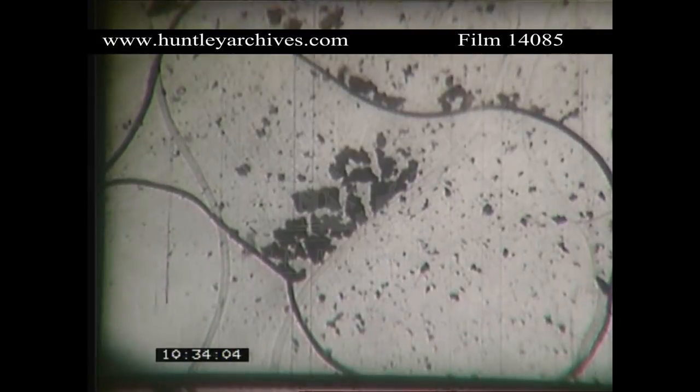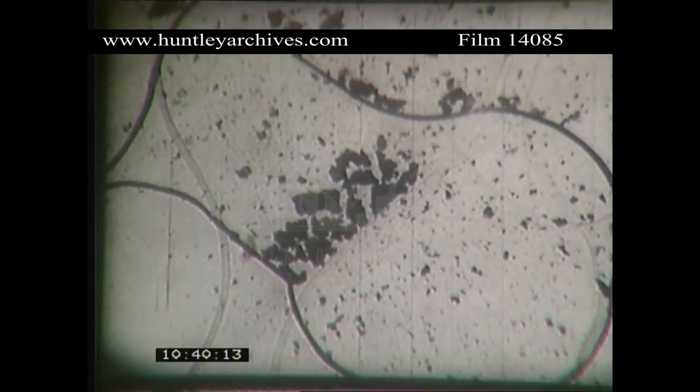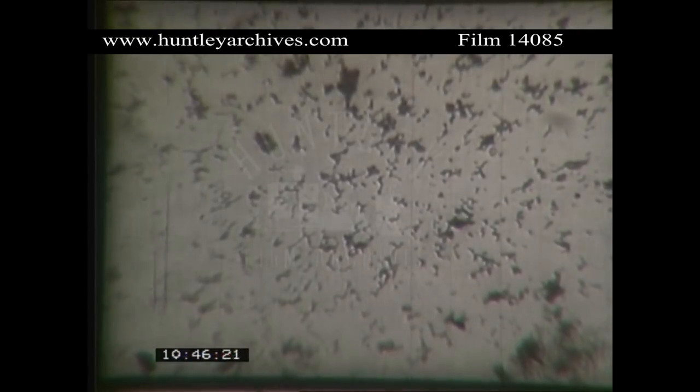Let us look at some specks of dust under the microscope. These may be fibers of wool, together with particles of soap from a blanket. That is the commonest form of blanket dust. When dust is cultured and examined under a higher magnification, we can see the bacteria that it can carry.